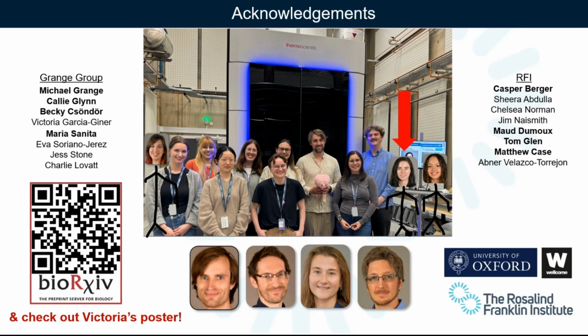Do you have any signs of autolysis, as the brain begins to die? We have been really diligent in preserving these tissue slices as well as we can, and we take our inspiration from the electrophysiology field. They often take sections of live brain and do patch clamping for hours, maybe 6 or 7 hours. So it's all about keeping them in oxygenated buffer that's pH controlled at the right temperature. So that's all done before the freezing step.